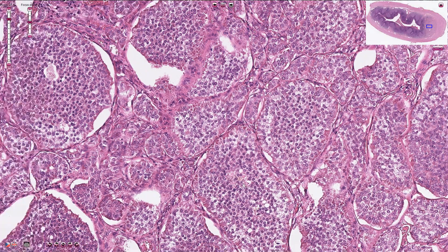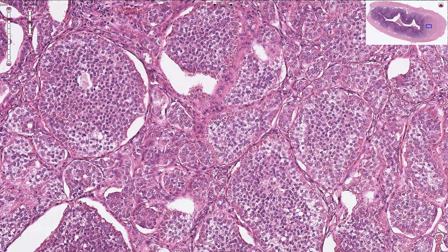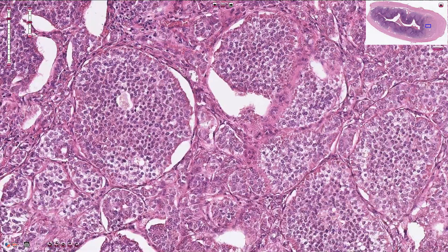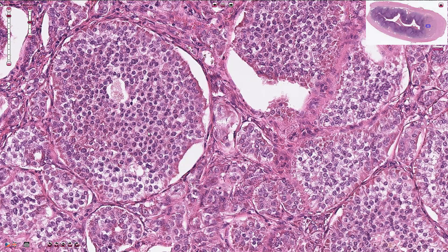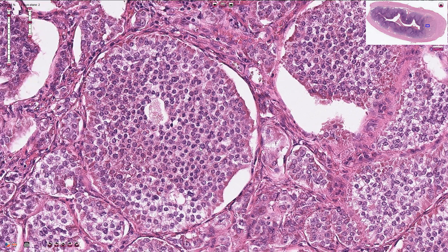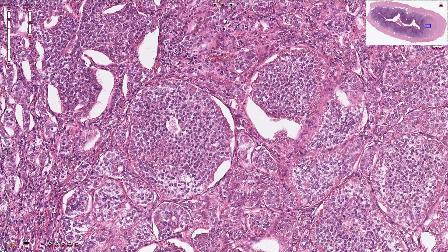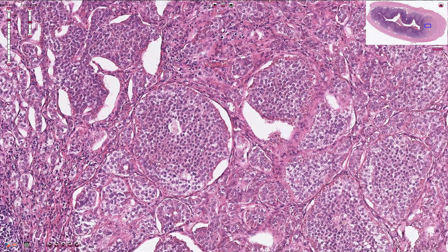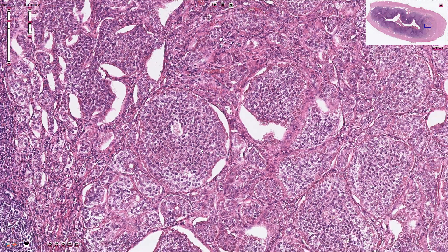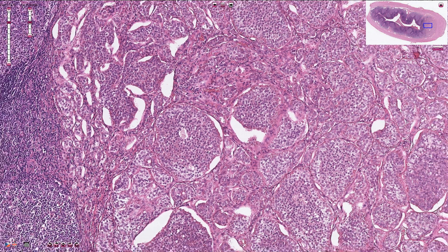The grading of the neuroendocrine tumor is based on mitotic activity. When we find fewer than two mitotic figures in ten high-power fields, we diagnose grade one neuroendocrine tumor. From two to twenty that's grade two, and more than twenty mitotic figures per ten high-power fields is neuroendocrine carcinoma.